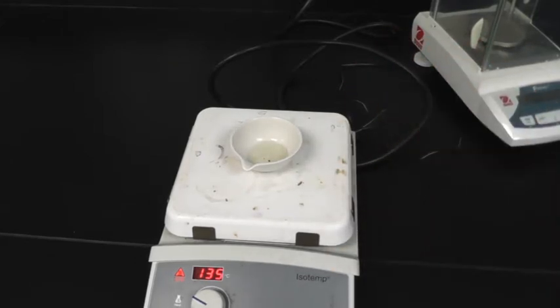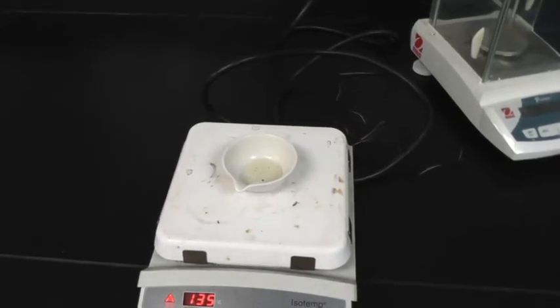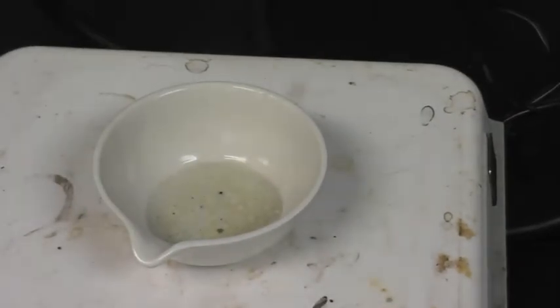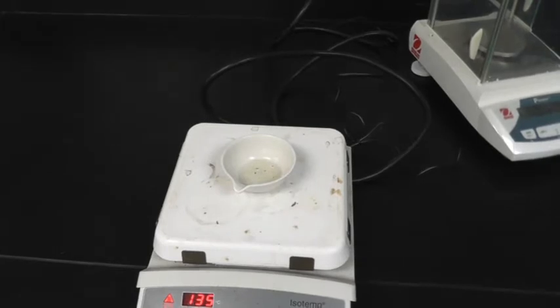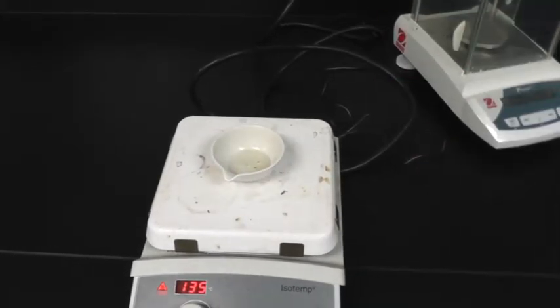You can see there's still some small bubbles forming, which is the nitrogen dioxide. So again, as heat is added, the rest of that gas is going to come out as well. And on a typical day, the room smells really, really bad as all this is coming out and filling the room. So anyways, I'm going to pause it for the next 20 minutes, and then you'll see the next step after 20 minutes.